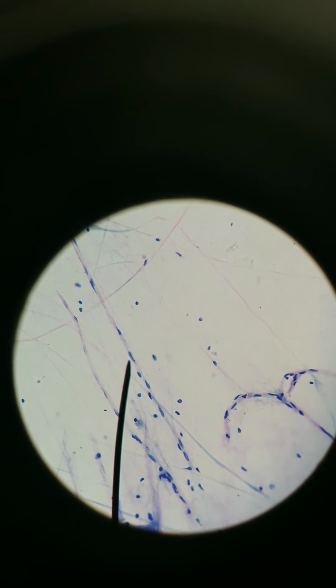If it was oligodendrocytes, you would see nuclei away from the axon, but they have processes that wrap around the axon. So once again, let me repeat, I'm concluding that these are Schwann cells along the axon, which means these are motor neurons with cell bodies in the spinal cord and axons that extend outwards, because individual Schwann cells wrap around sections of the axon. If it were an oligodendrocyte, the reason why it's called oligo is because it has many extensions. It's just one cell with many wrappings around a given axon. So we don't see that. We see many cell bodies all along the axon. So I'm inclined to say Schwann cell.